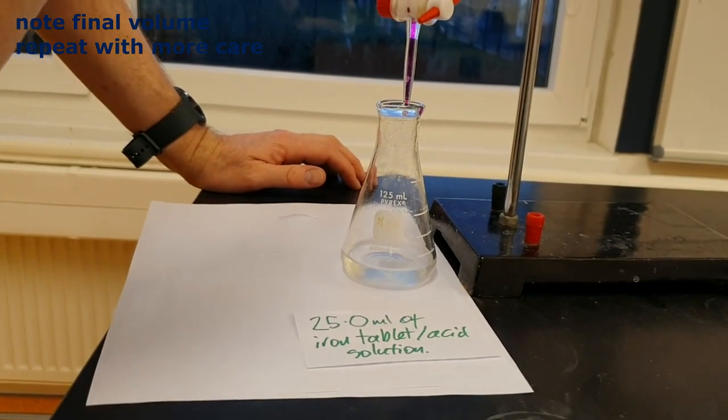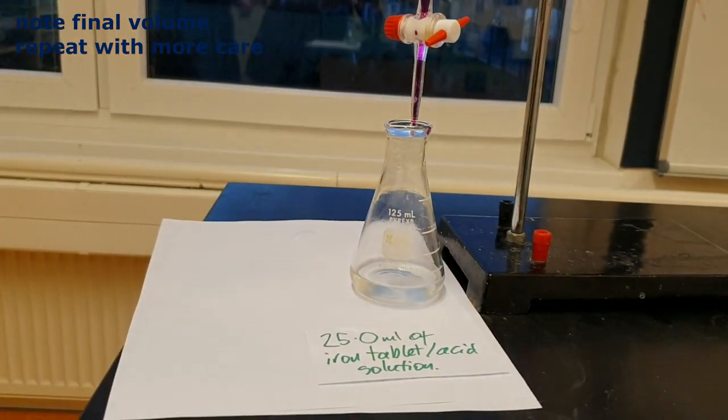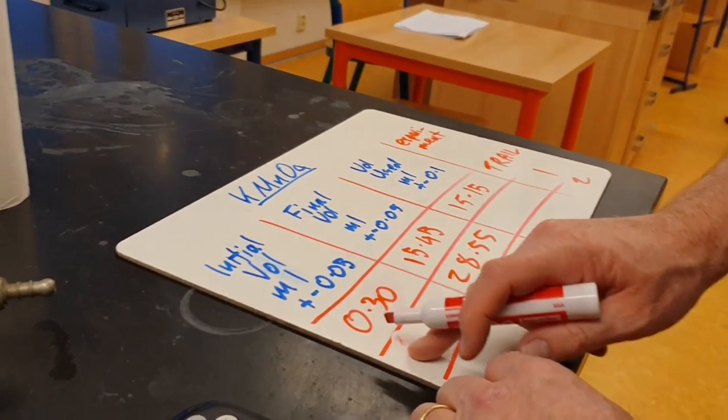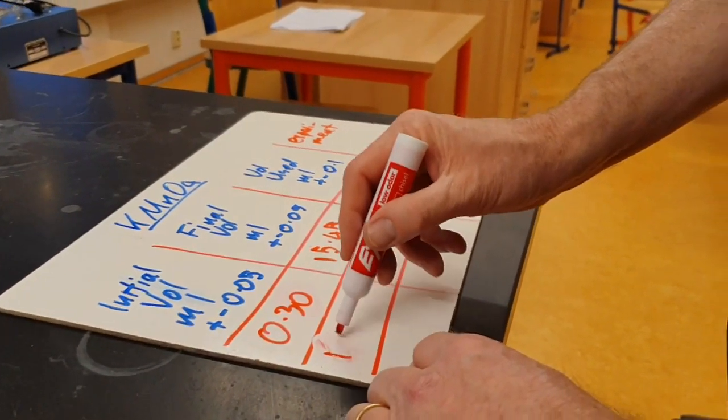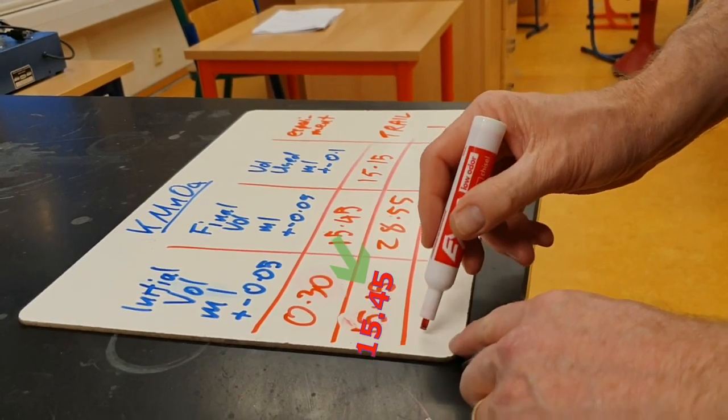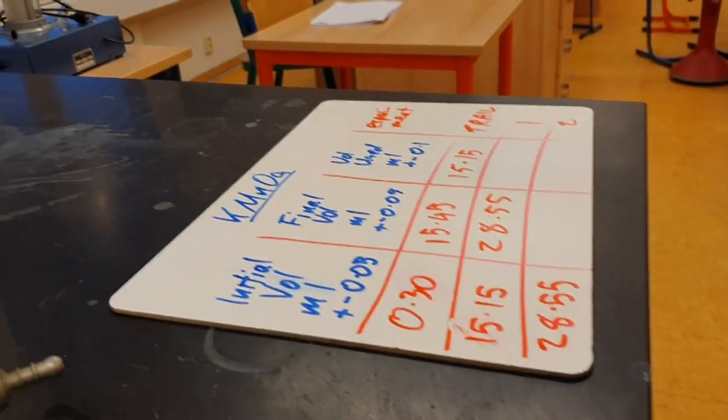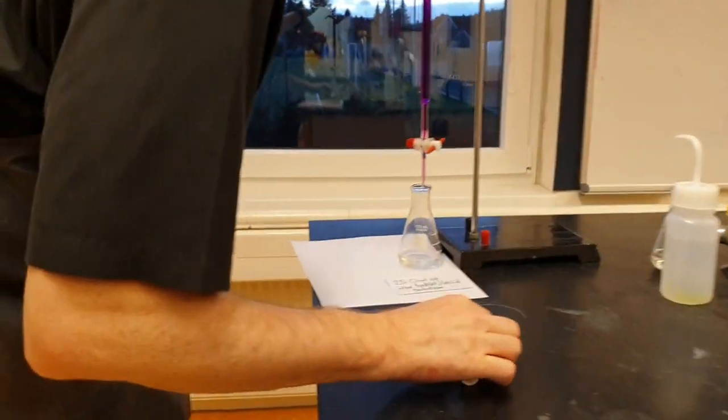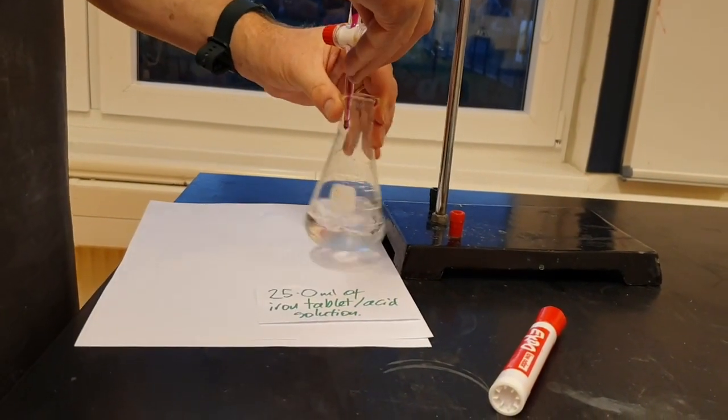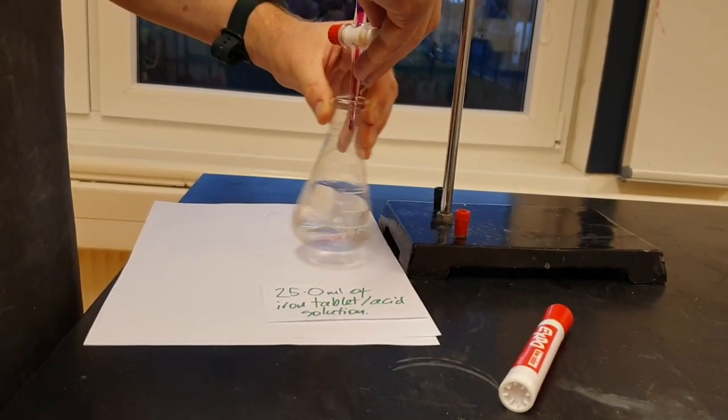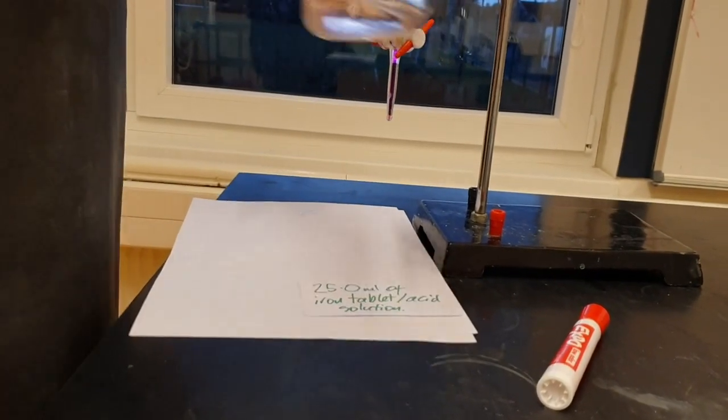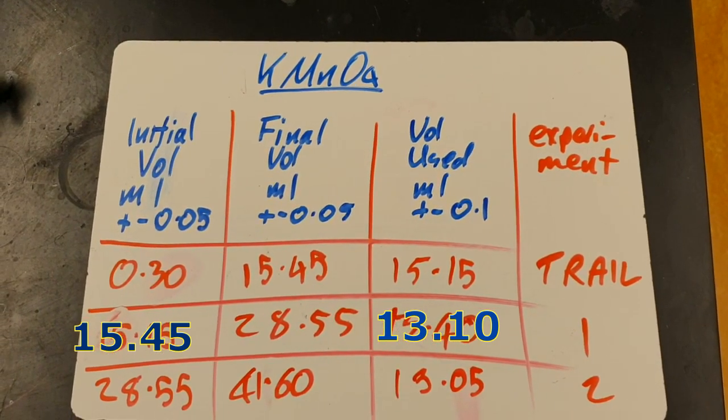So the volume for that is 28.55. And so 28.55 is where we're going to start. We've still got enough. 28.55. So I'm going to add 10. So I'm going to add 10. That's it. So there's the final data.